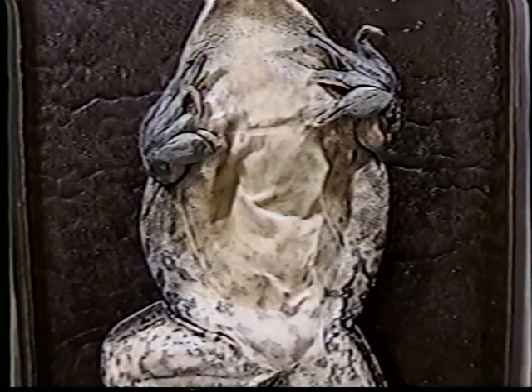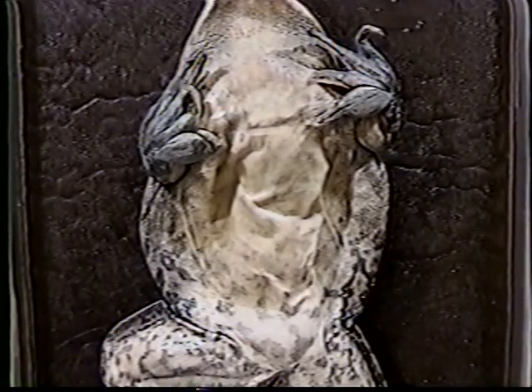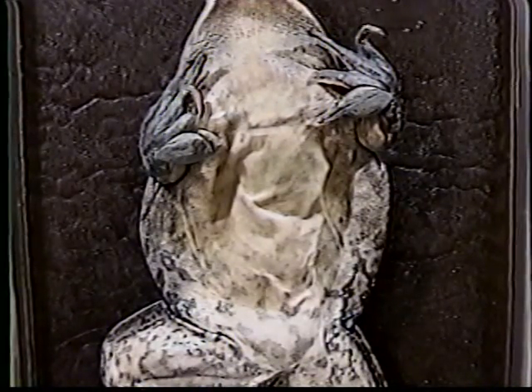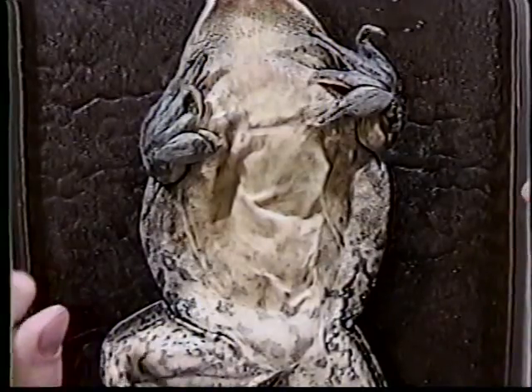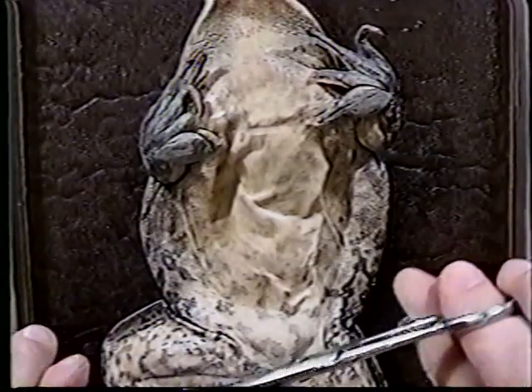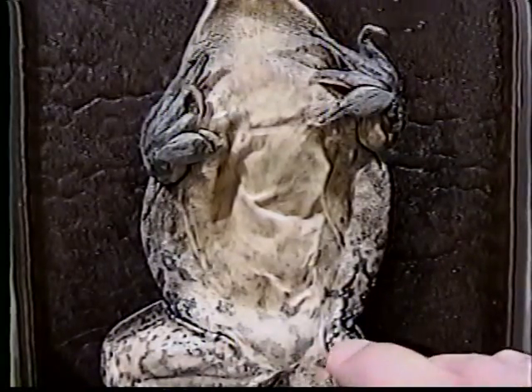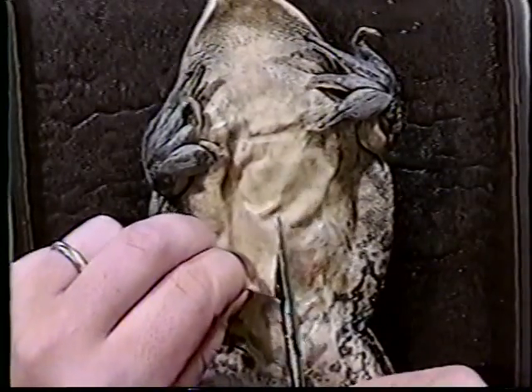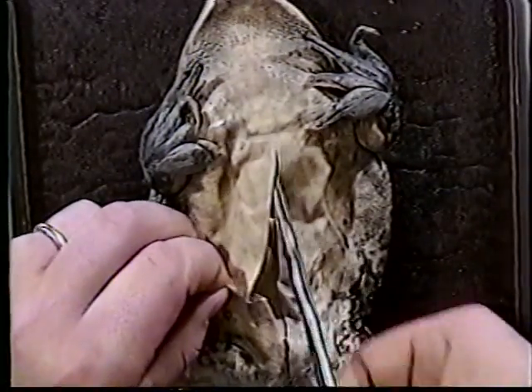We are now going to pin the skin of our specimen. We need to keep in mind that a very important organ of the frog is its skin. Not a lot of people view the skin as being an organ, yet the frog is very dependent on this for life. To pin the skin, we will need to cut in a T-like formation from the anus area up through the middle of the frog and then make a T shape toward the top.